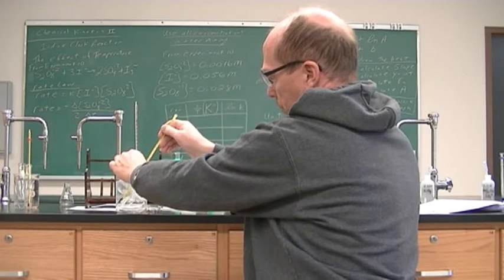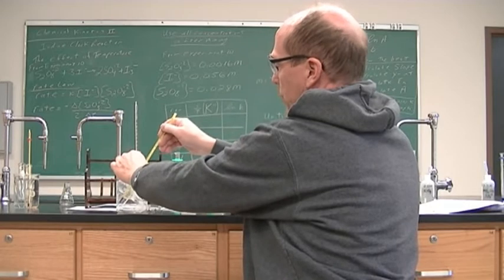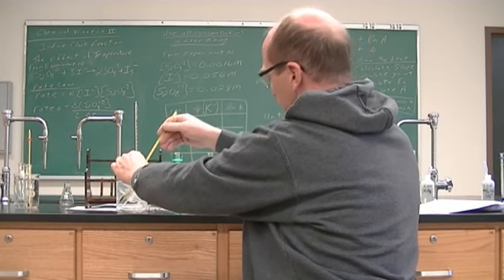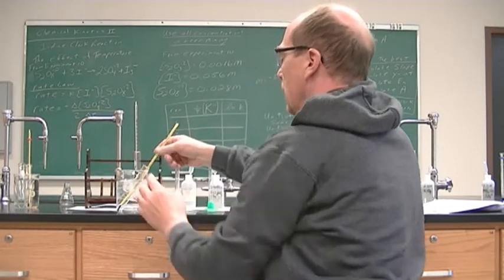Make sure it is as thoroughly mixed as I can get it. For the stopping point, the whole solution has to be blue, not just the top, not the bottom. All right, so we're at the 1 minute mark.